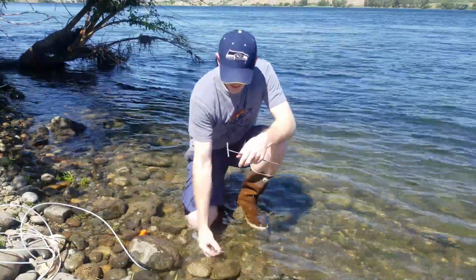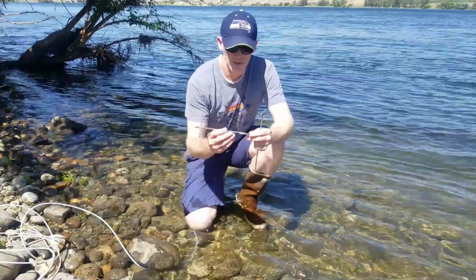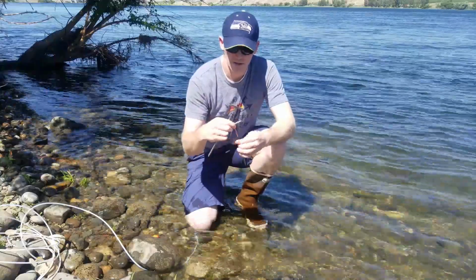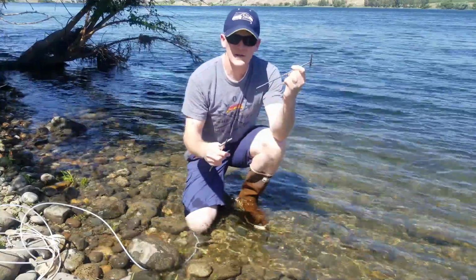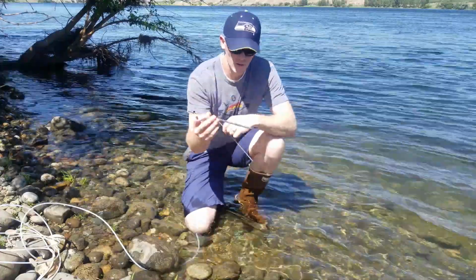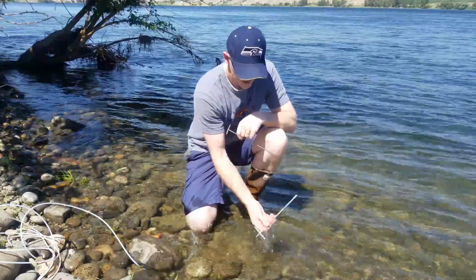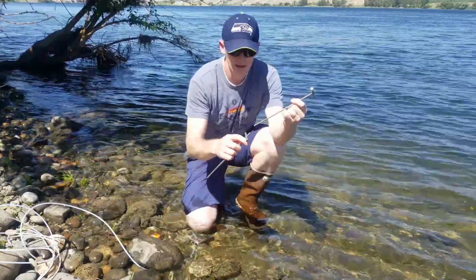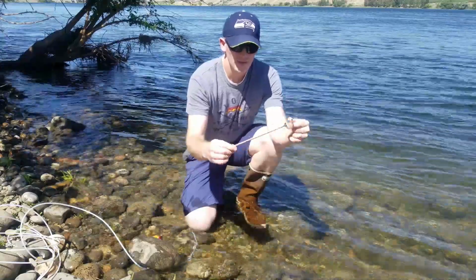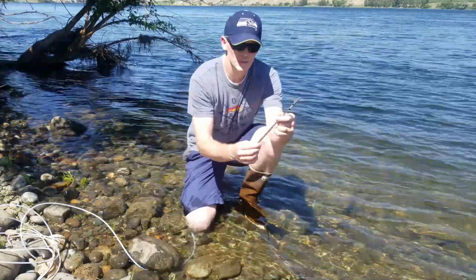Then when you install or remove your push point from the subsurface, you want to take the stock off, and then there's usually sediment inside of the push point. The support rod is really critical, and it's very finely milled to just barely fit inside the push point. So you want to wash it out pretty good. Give it a pretty good rinse, dump it out a few times, and then gently insert the support rod back in. If you get any resistance, it feels any kind of gritty, wash out the push point again.